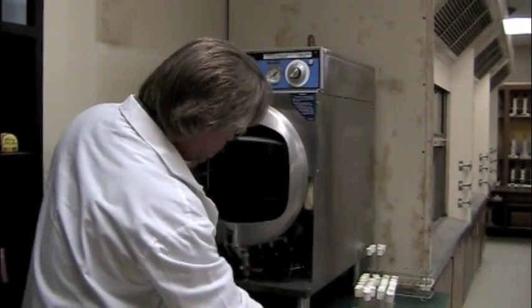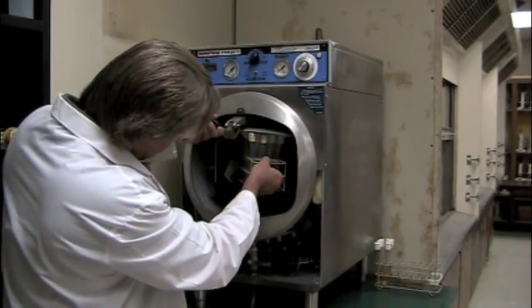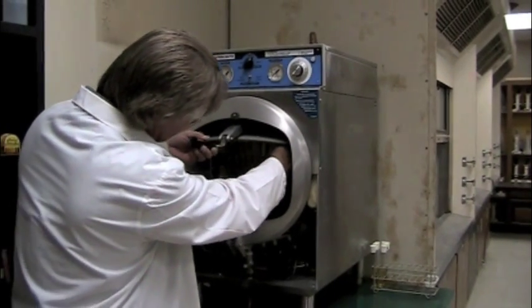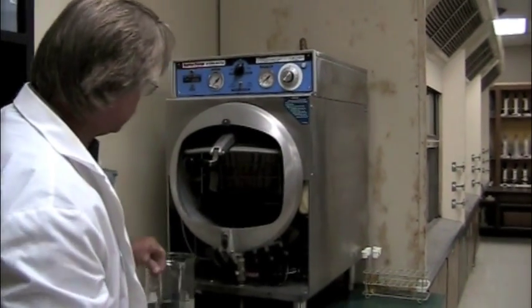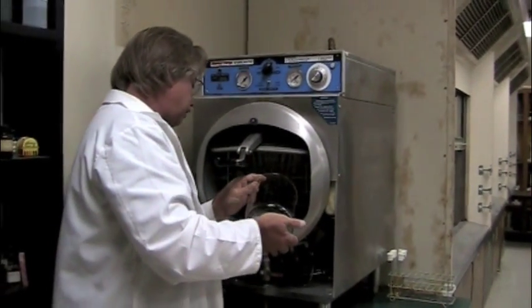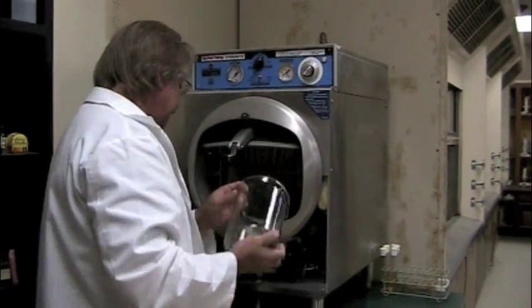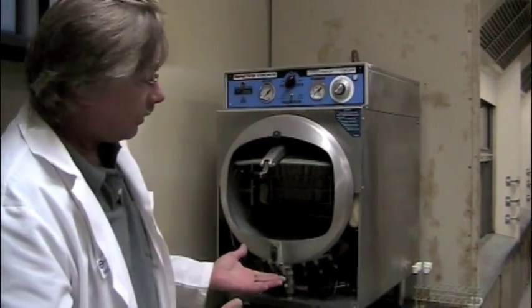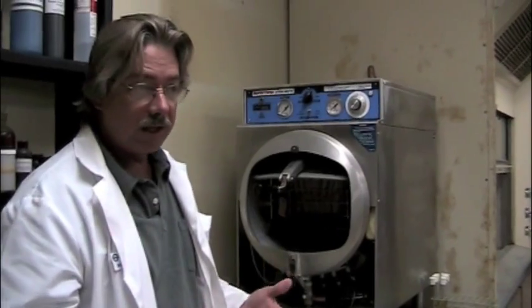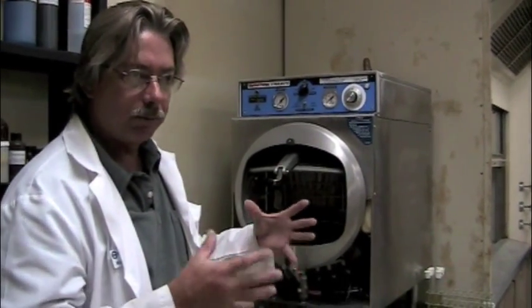I can put my test tubes in as well. We got it loaded. Now what we have to do is take distilled water and fill up the autoclave with it. The autoclave will heat that water to boiling and then some, and the fact that it's a sealed unit will create pressure.